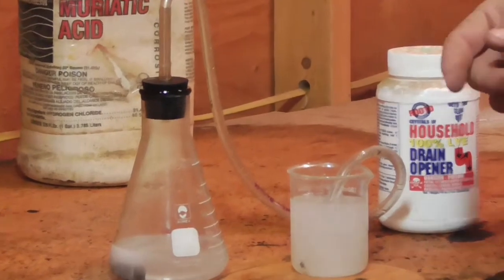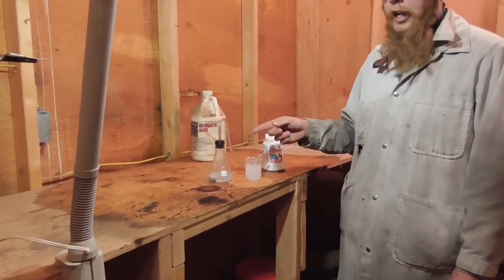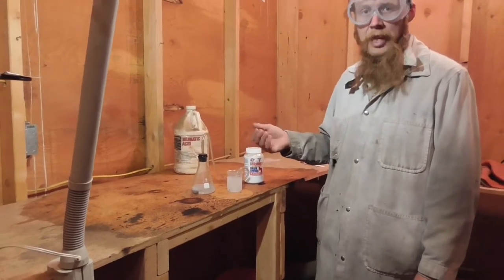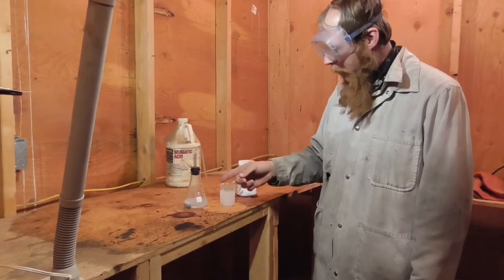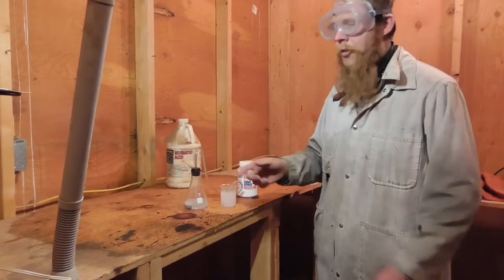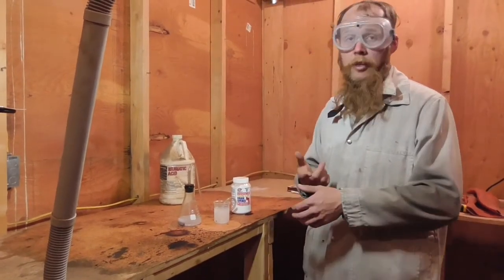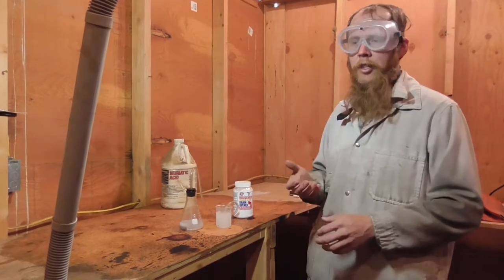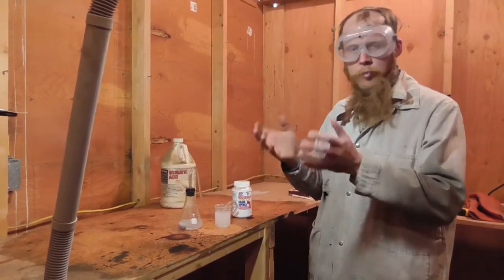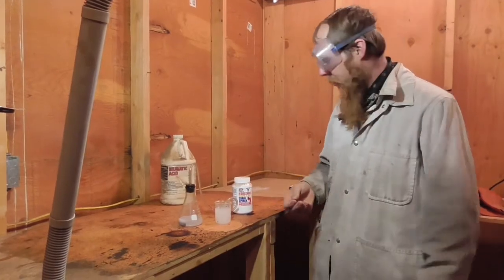Now one word of caution: the reaction is significantly exothermic and the reaction rate is of course temperature dependent. The reaction will typically start off quite slow and then the reaction rate will increase as time goes on, both because the solution starts to heat up and as the acid attacks the aluminum, the surface becomes pitted and increases the surface area, which also increases the reaction rate.